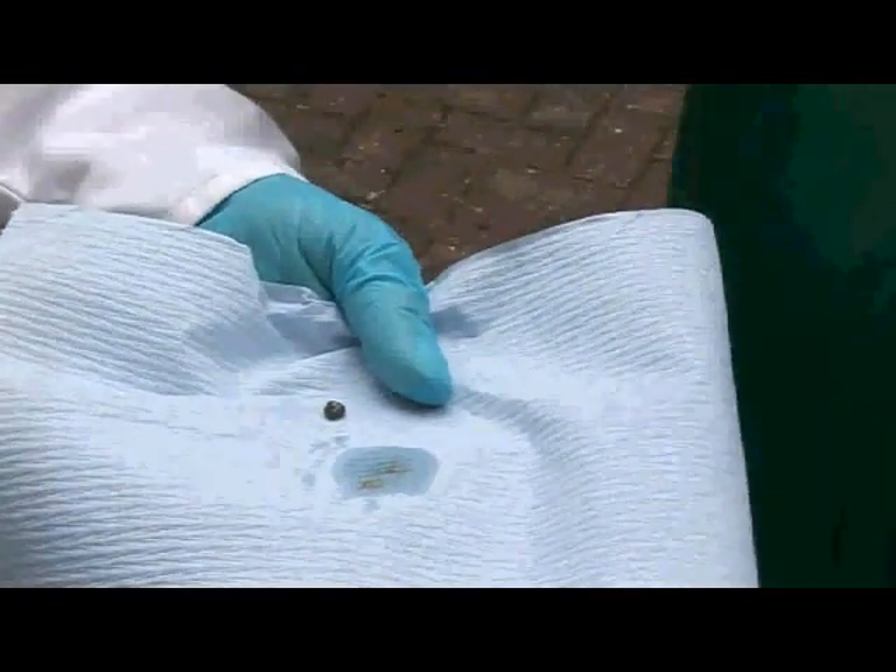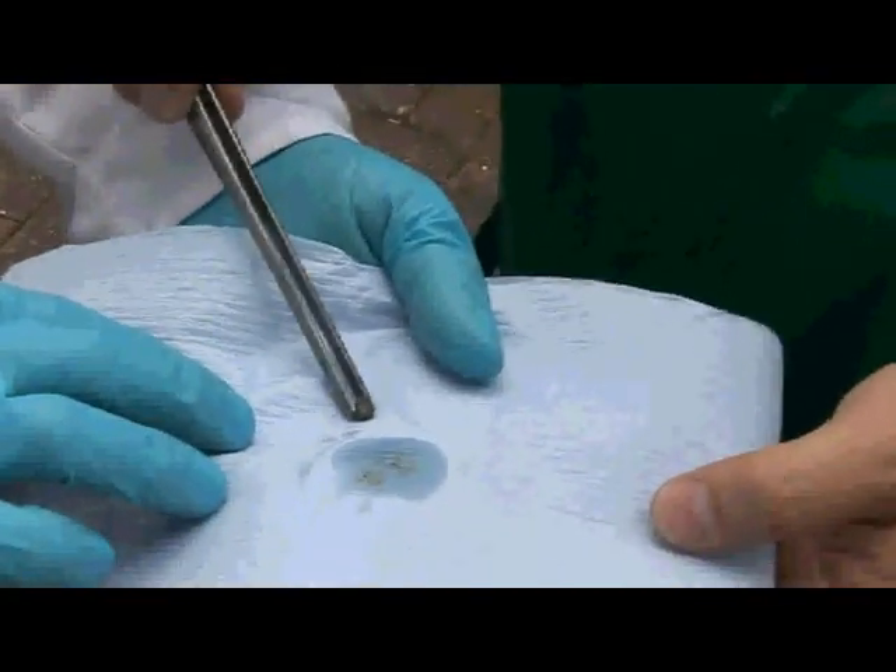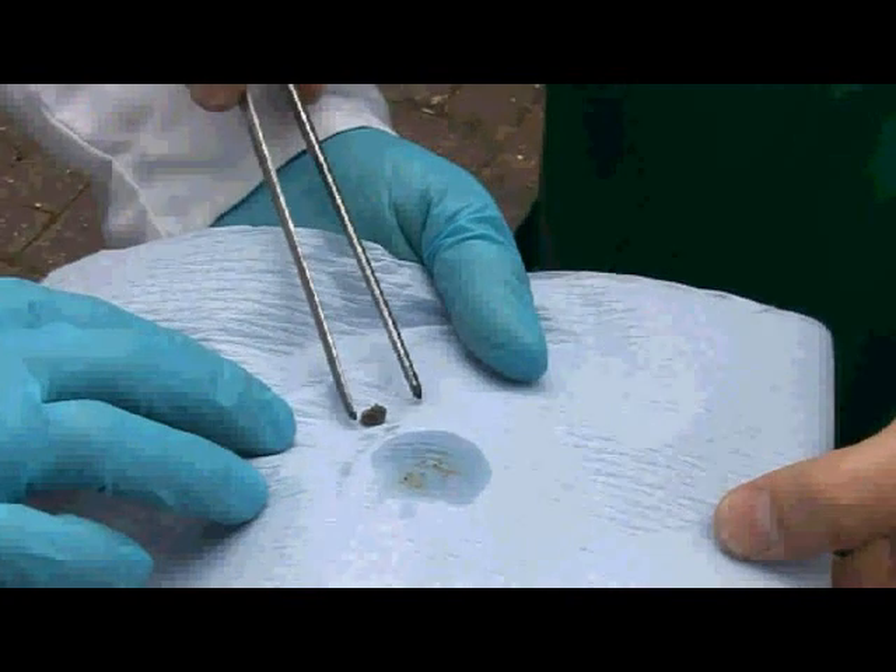So here we have a sample of potassium. It's a really quite nice metal — a very small sample — but it's really soft. You can see it's a bit like chewing gum; I can squeeze it with the pliers.